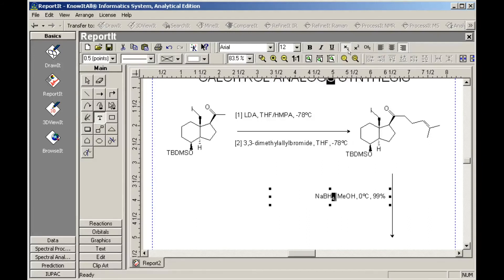We'll create the next structure by modifying an existing structure using the drawing tools found in the reported application. First, copy and paste the second structure and move the copy below the reaction arrow.